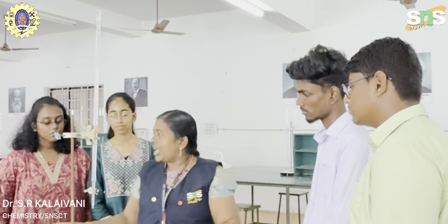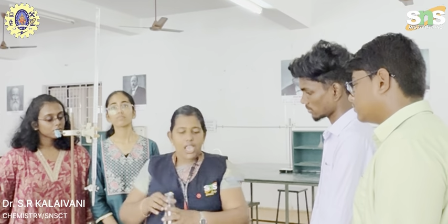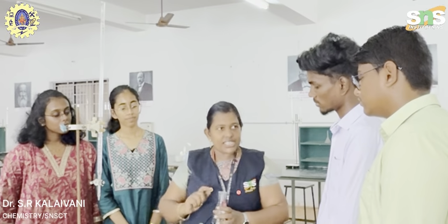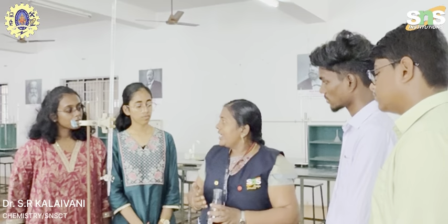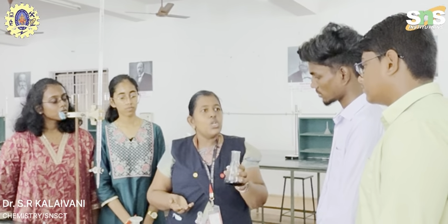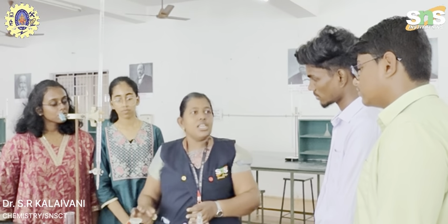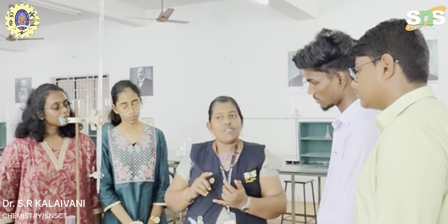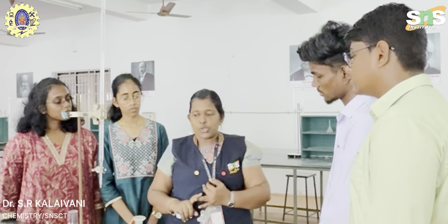So again the same 20 ml of the tap water is pipetted out, then ammonia buffer is added to the same solution, and EBT indicator is again added. The solution turns wine red color. That wine red color is titrated against EDTA, and it turns to steel blue. So in titration 2 we can find out the total hardness amount. So the first titration is always standardization, and the second titration is estimation of total hardness.